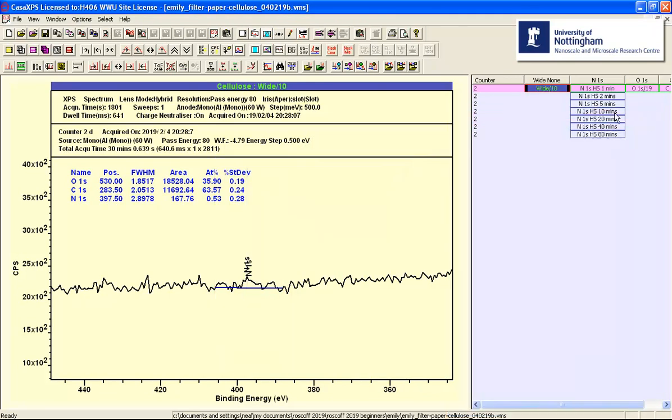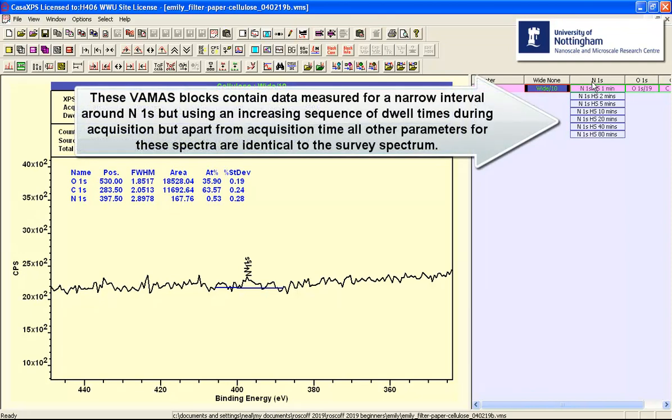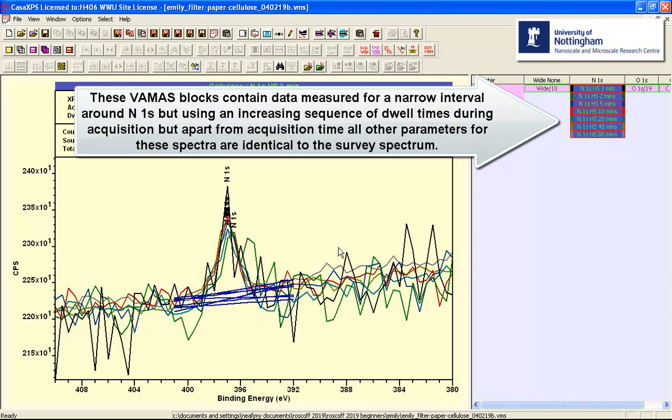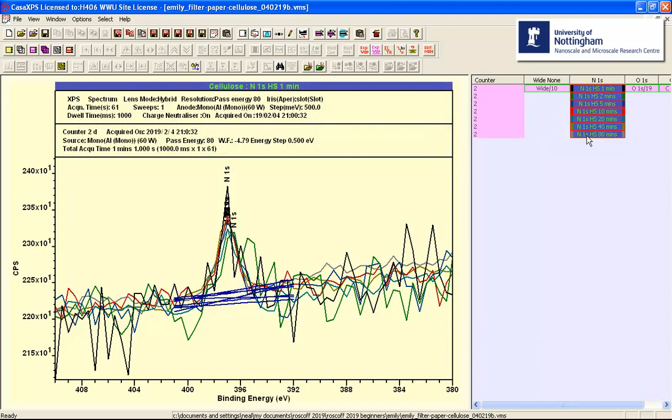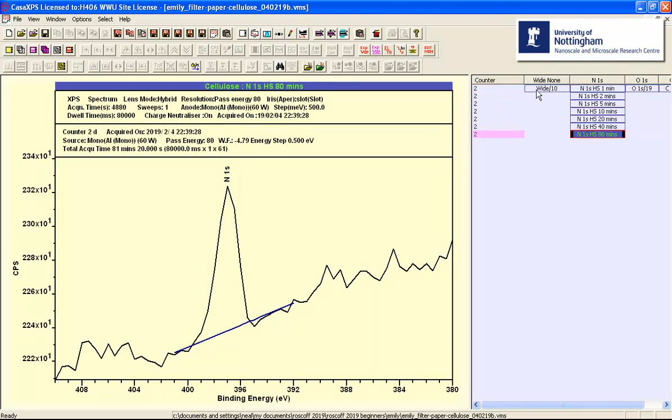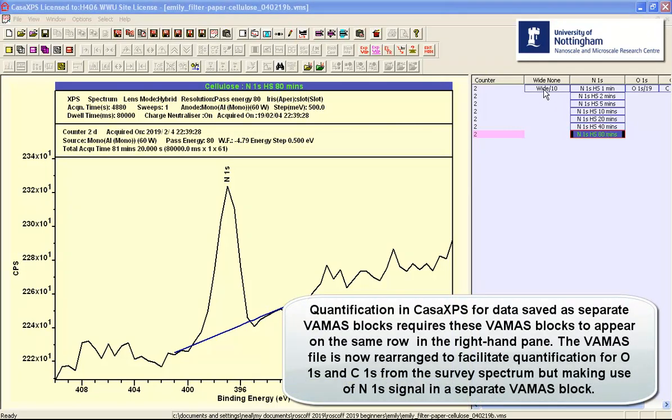However, we can alter the calculation by rather than using the nitrogen peak here, we could use one of these nitrogen peaks. And these are all nitrogen that have been measured using the same conditions as the survey spectrum, but with an ever increasing acquisition time. So the signal to noise should improve as we increase the acquisition time and we need to now verify that we can identify a peak such as this one using the same method applied to the survey spectrum.